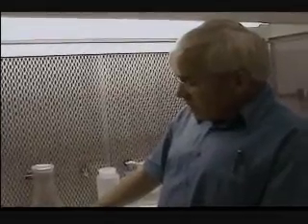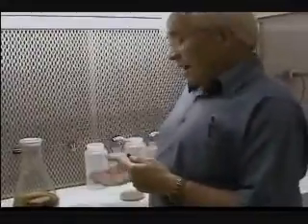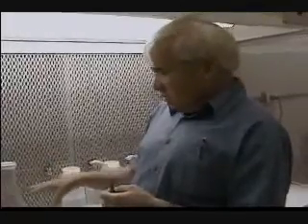In these bottles, we're growing without the plant, so the nutrients are carbohydrates — sugars mostly — along with lots of micronutrients that replace what the plant would normally give the fungus. So there's more than carbohydrates involved — it's basically a simulated symbiosis. There's a lot of work to develop the nutrient mix to grow specific fungal organisms, because Pisolithus tinctorius has slightly different growth characteristics and requirements than the boreal species. The nutrient mixes are different for each species, and once we identify which particular strains are adapted for high nutrient uptake, those are screened and that's what gives us the best growth in the field.